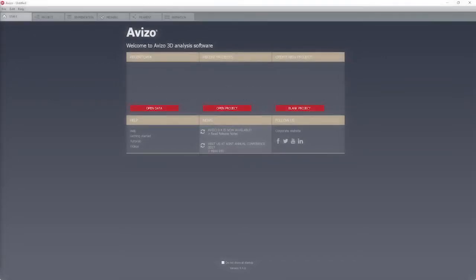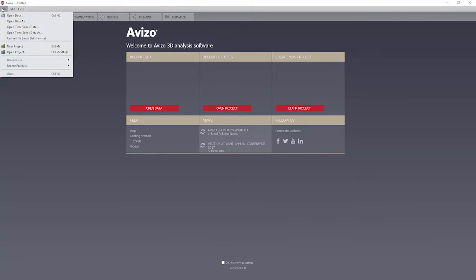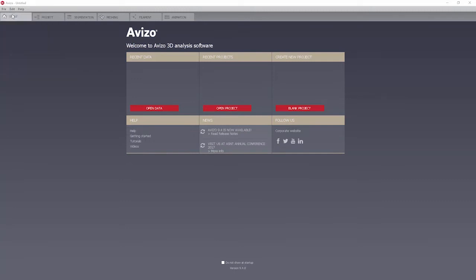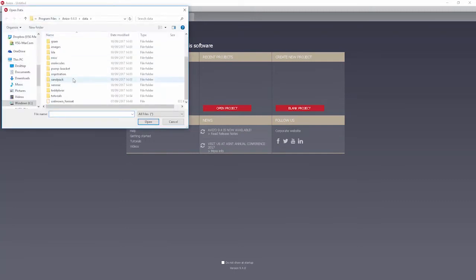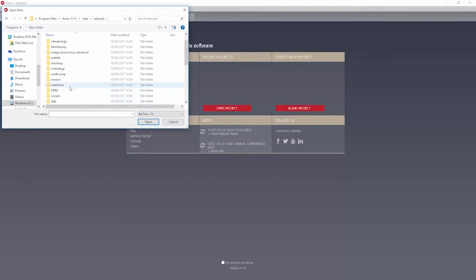Orthogonal slices. We start here by loading a part of a CT scan of a chocolate bar. Please browse the folder data tutorials and load the file chocolatebar.am.